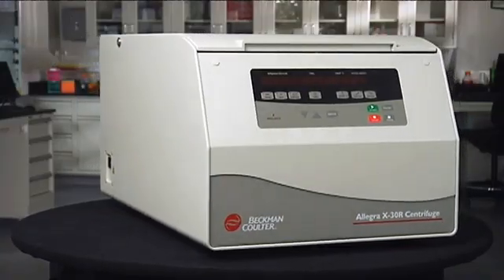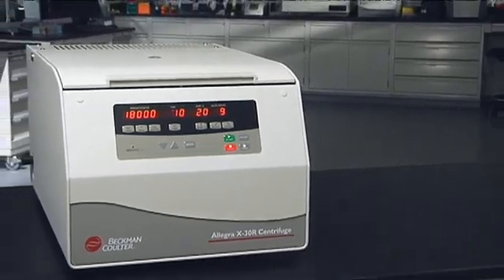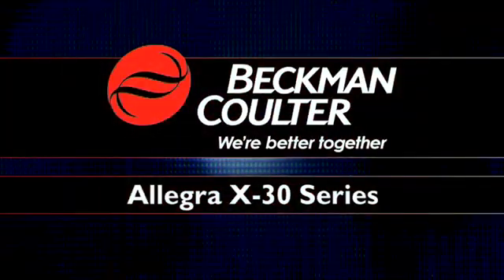Your centrifuge is at the center of your lab — a place around which much of your testing revolves. So it's critical that you work on the instrument that best suits your needs. Beckman Coulter delivers it.